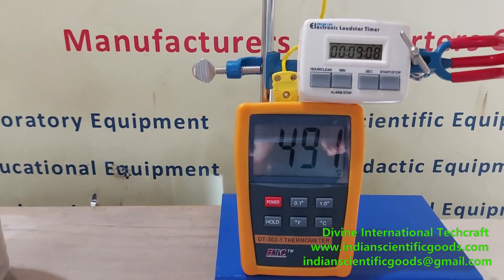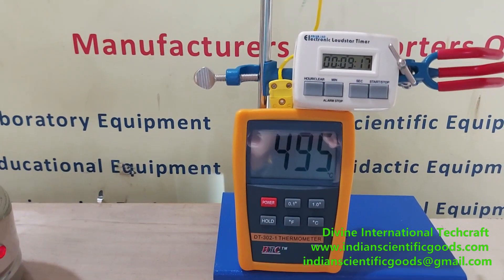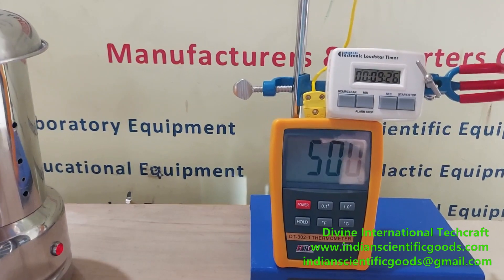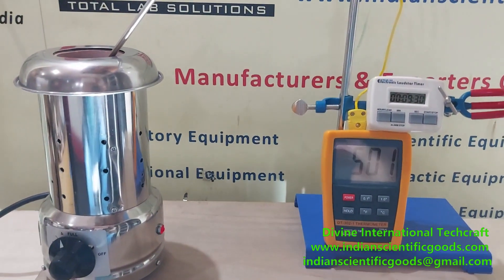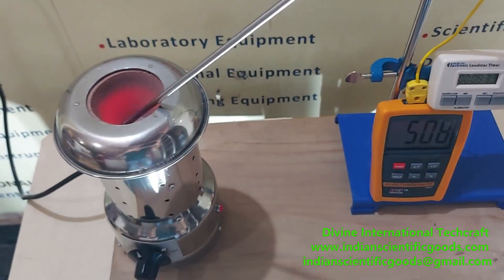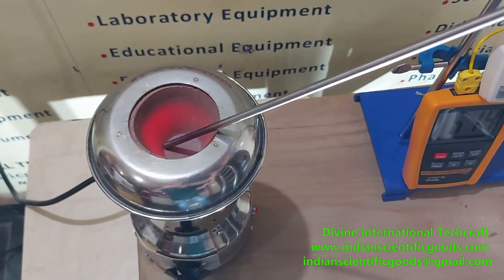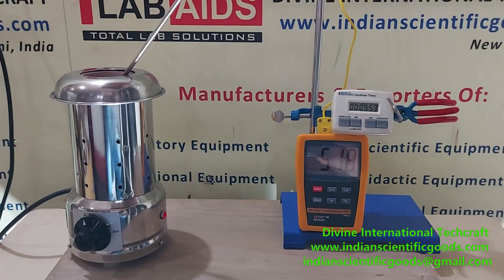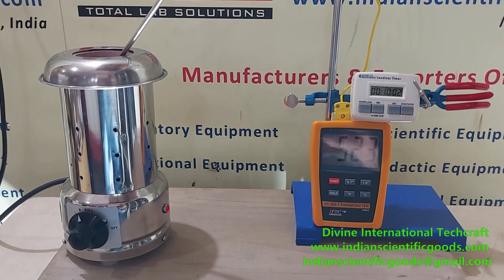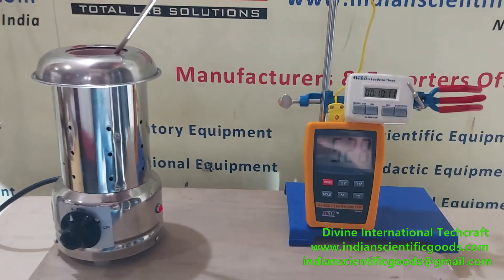Nine minutes have passed and the temperature is now almost 500 degrees centigrade. You can see it is almost 500 degrees centigrade in about nine minutes and 25 seconds. You can see that the crucible is red hot at this moment — inside the crucible it is absolutely red hot, just like the sun. The temperature is now about 525 degrees centigrade and time elapsed is 10 minutes.